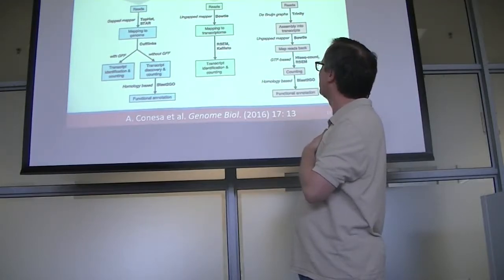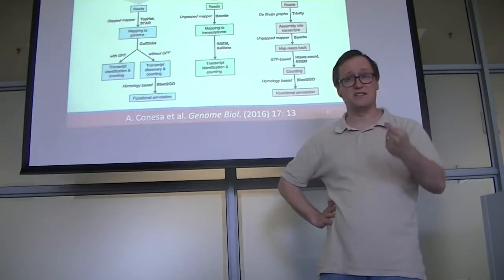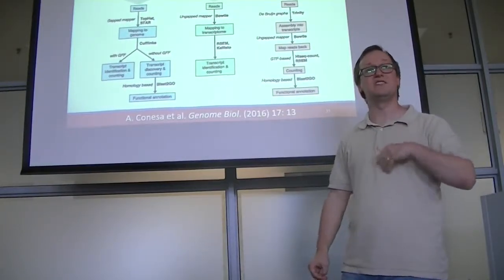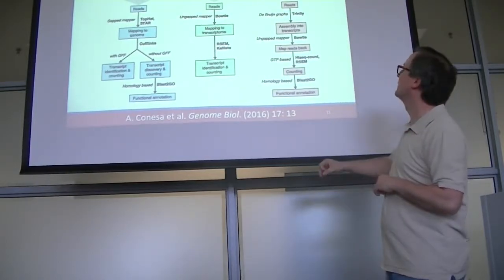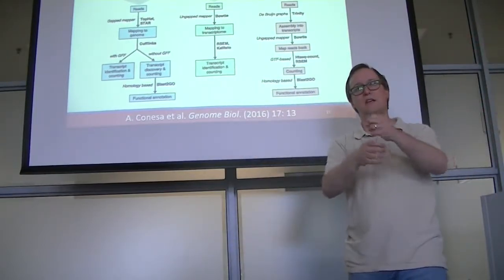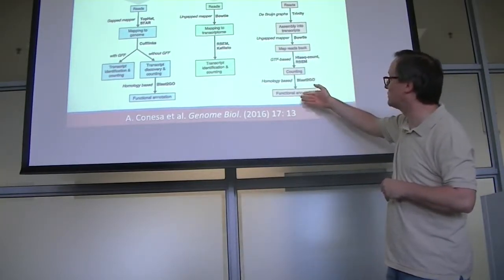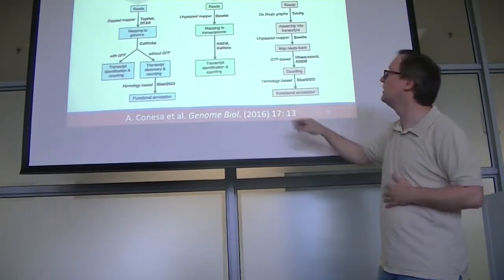I feel like I've already kind of talked about these, but it's valuable for us to think about the tool sets that allow us to do these things. The system I was using was called Trinity. Trinity uses these De Bruijn graphs that we talked about at the start of the month of April. So being able to create these graphs and de novo assemble transcripts out of just read information is possible. From that, you can try to figure out which ones you trust and put functional annotation on them. This is the process that we had to use for our chia project.